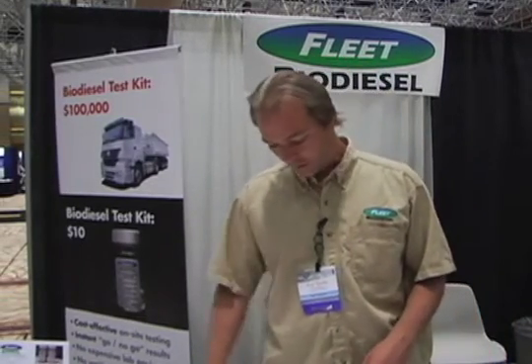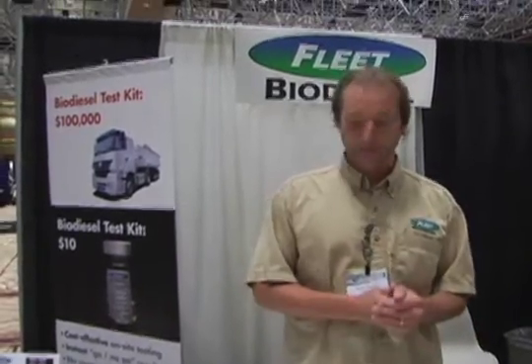There are different quality indicators for biodiesel fuel. Water is one of them, so we have a test for water. We've got a test for glycerin contamination, the percentage of biodiesel, and something called the acid number — which is when biodiesel degrades, the acid number comes up and it can cause some problems in the engine.